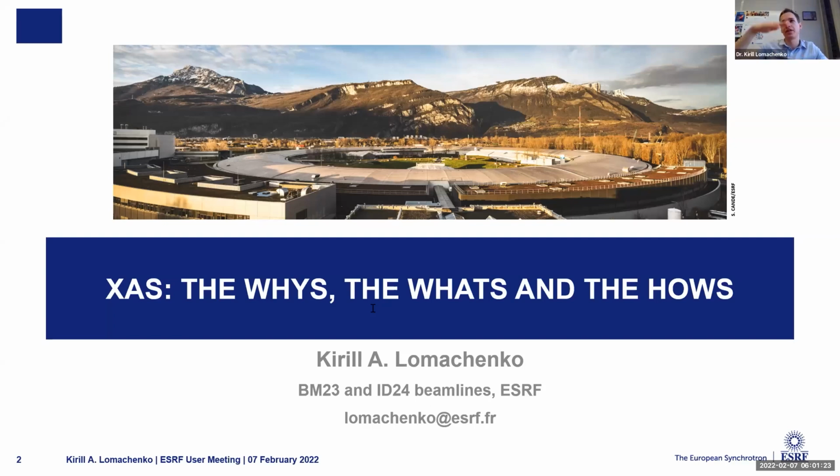Everything gets squeezed, the spectral features get squeezed. Whether it influences XANES or EXAFS more, probably it's more important in EXAFS, but in XANES you can also see it. So yes, it influences both.